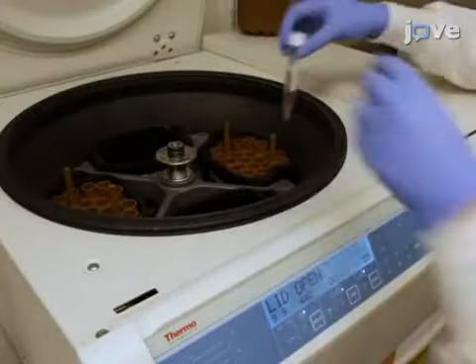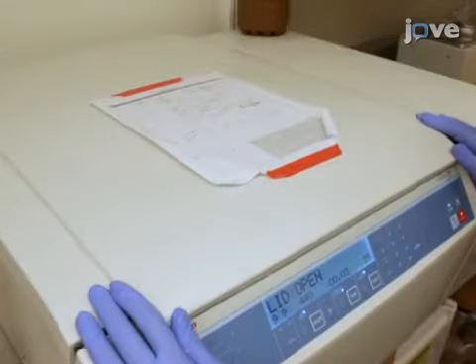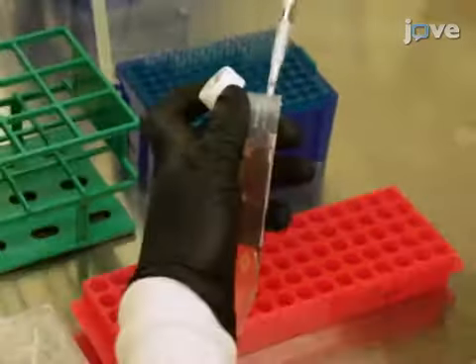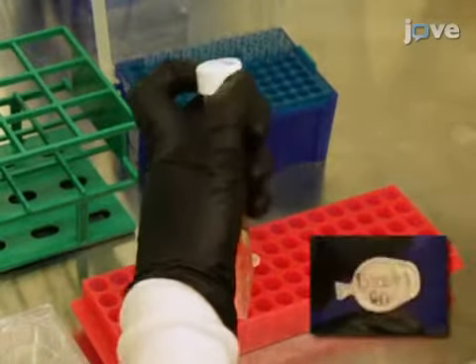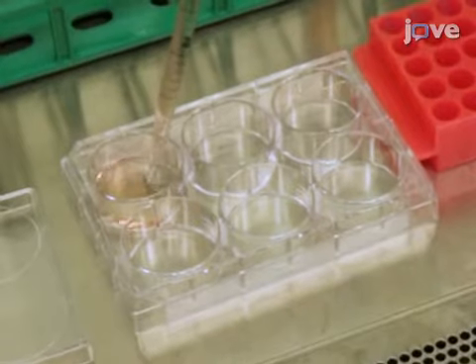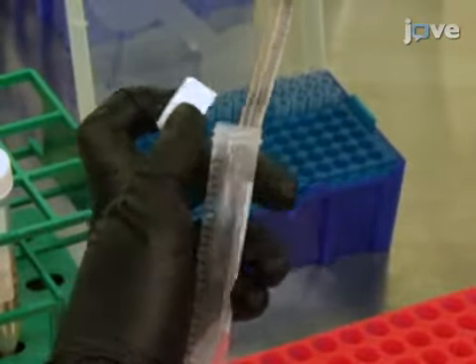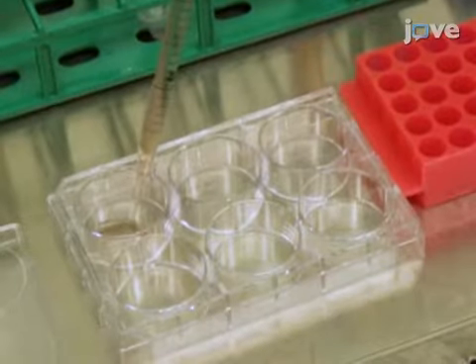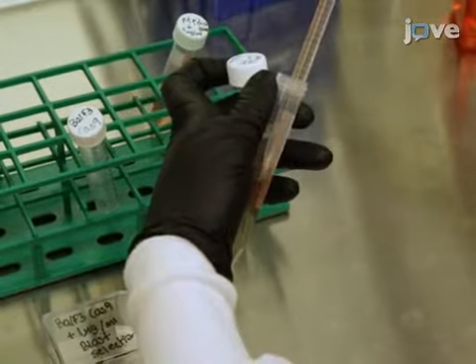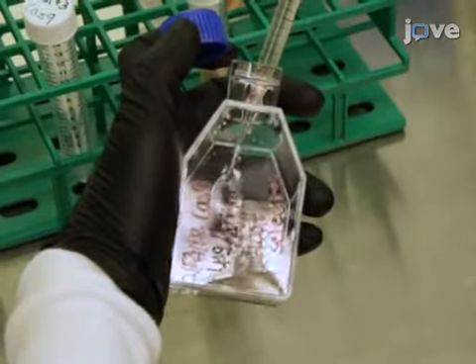To select the Cas9 infected cells, first spin down the cells, and then resuspend in fresh warm media supplemented with 5 micrograms per milliliter of blasticidin after 48 hours of spinfection. Continue selecting cells for 9 days with blasticidin till all the uninfected cells are dead. Then transfer the resistant cells to a medium with 1 microgram per milliliter of blasticidin.